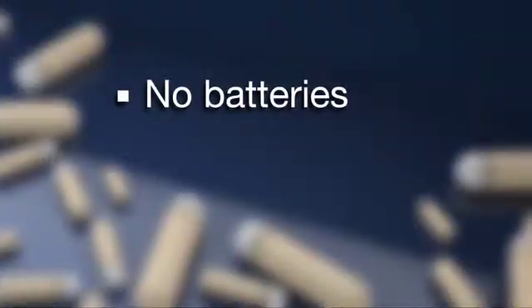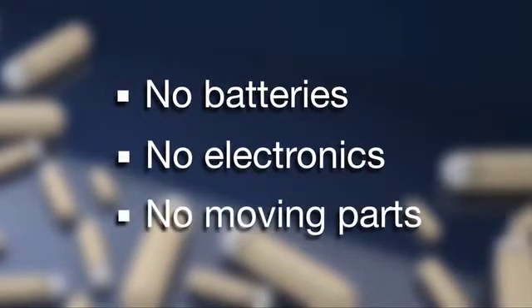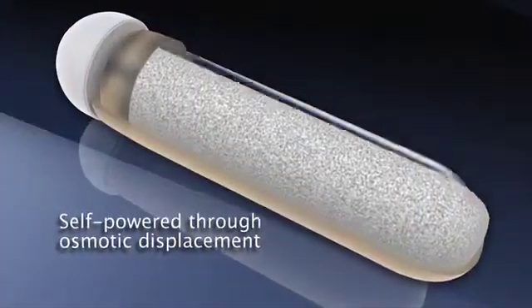ALZ osmotic pumps have no batteries, no electronics, and no moving parts that can fail. The pumps are self-powered through the reliable process of osmotic displacement.